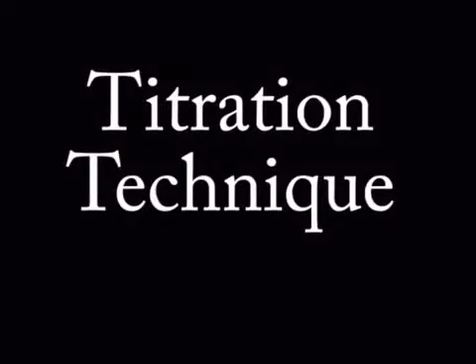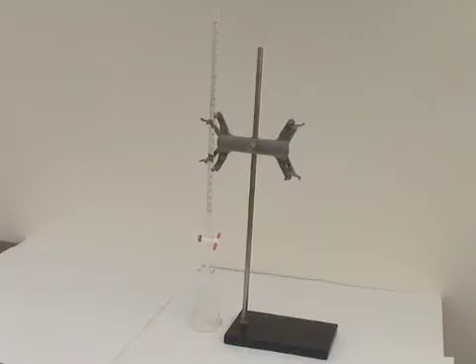In this video, we're going to be showing you titration techniques that will allow you to get both accurate and precise results from this particular analytical procedure. Although the titration in this video is an acid-base one, the techniques will work equally well on any type of titration.